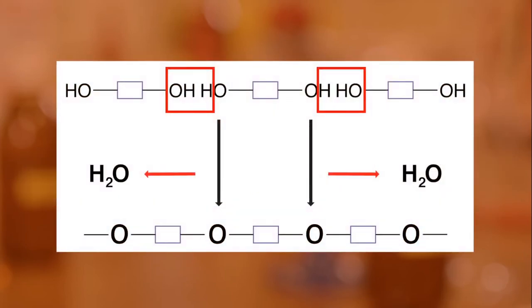This experiment shows the hydrolysis of starch using hydrochloric acid and enzyme. It also shows the tests for the presence of starch and simple sugars.